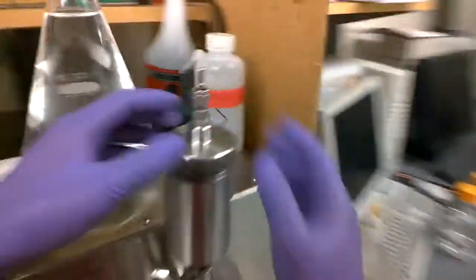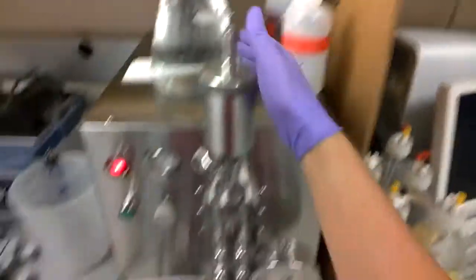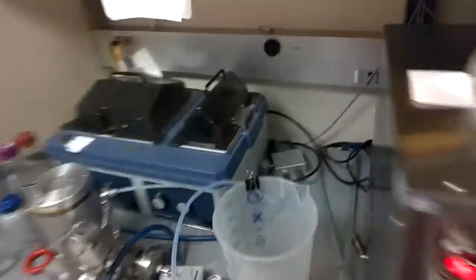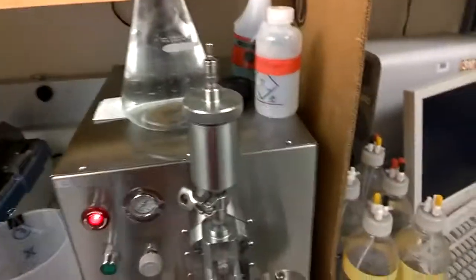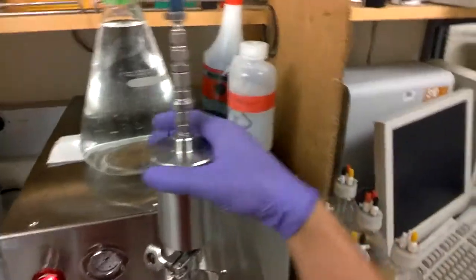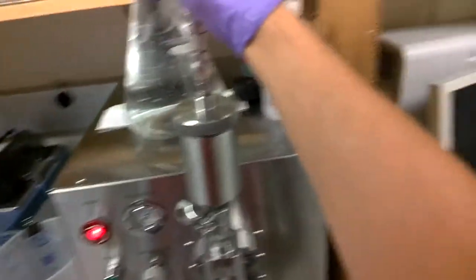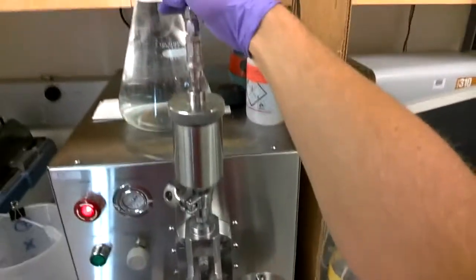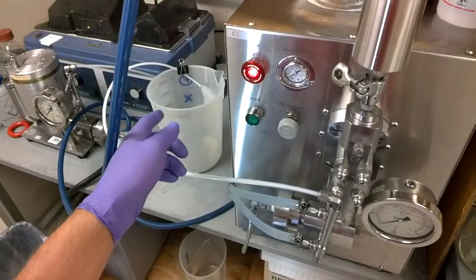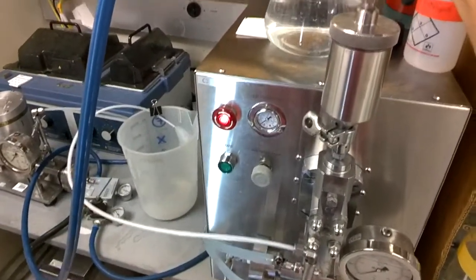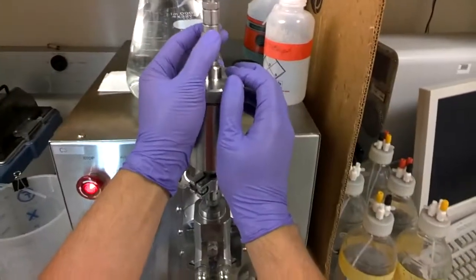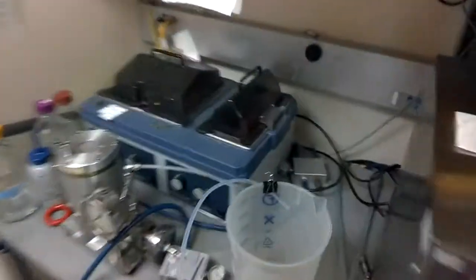And so the first thing we're going to do with Emulsiflex is we're going to wash it. And so to wash it, this is connected to house air, so building air. And so it's stored in ethanol, and we need to flush it out. And so you just click it in, and then you can see over there basically all the ethanol comes out. And once it stops coming out, you're just pulling this down, up, and then it's good.